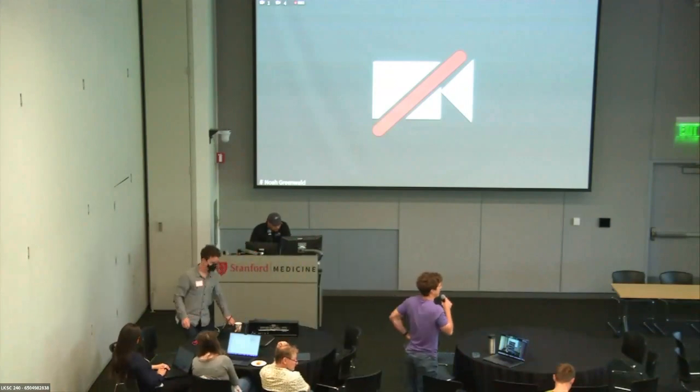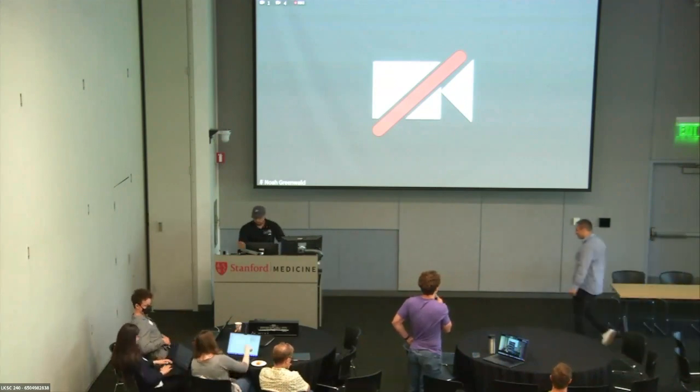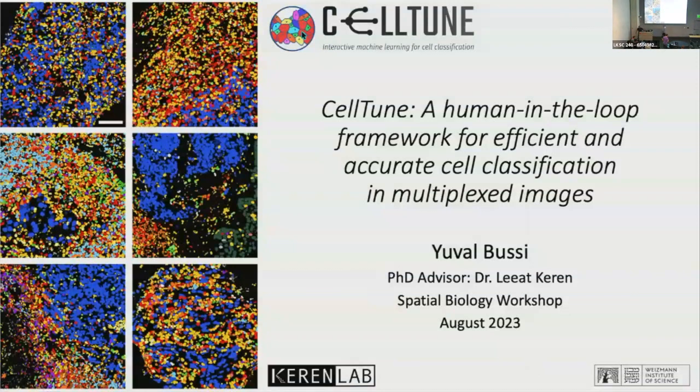Next up, we have Yuval from the Weizmann Institute, who's going to talk to us about their new cell classification pipeline. Hello, everyone. My name is Yuval. I'm a PhD student at the Weizmann Institute in Leeat Keren's lab, past postdoc from the Angelo Lab. And I'm really excited to share with you another solution to the same problem called CellTune, a human in the loop framework for efficient and accurate cell classification.